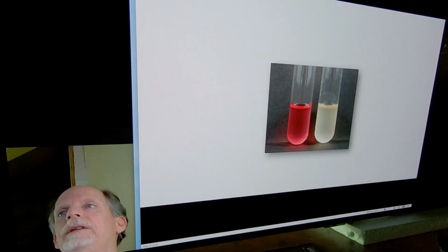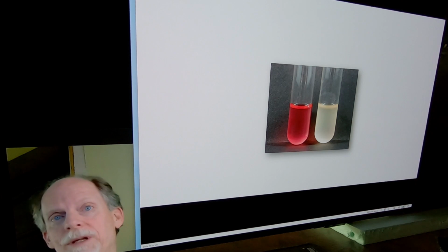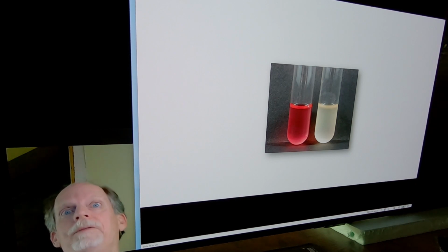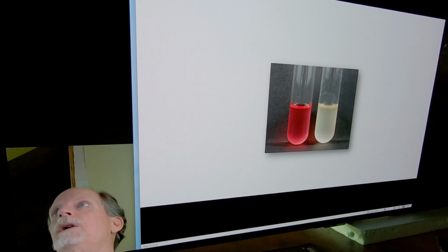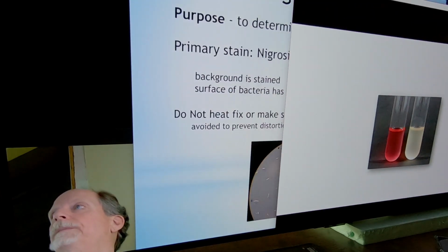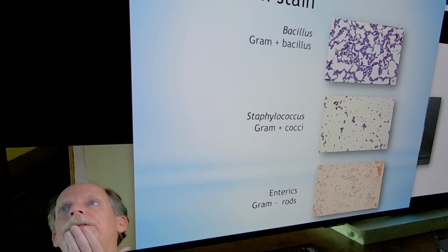And so I think this will be helpful having this. Now, this one is for the Methyl Red Test, right? But the MRVP media is what's used for this. So if I ask, what's the name of the media used for this test, it would be the MRVP media. Okay. So anyway, I think that one will be helpful.